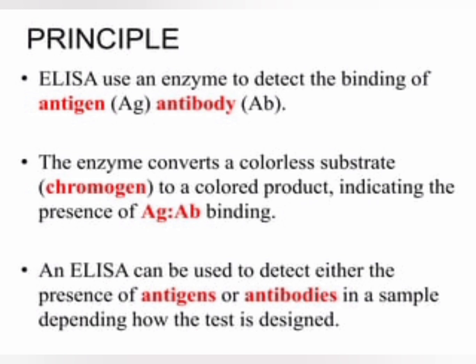In comparison to an indirect ELISA, a direct ELISA uses an enzyme conjugated antibody to directly measure the antigen bound in the plate wells. Direct ELISA is rarely used and generally it is not in use, so not discussed. The iteration of indirect ELISA is quite popular and is considered to be the method of choice for the identification or detection of serum antibodies against the human immunodeficiency virus, means the HIV, known as the causative agent of AIDS.